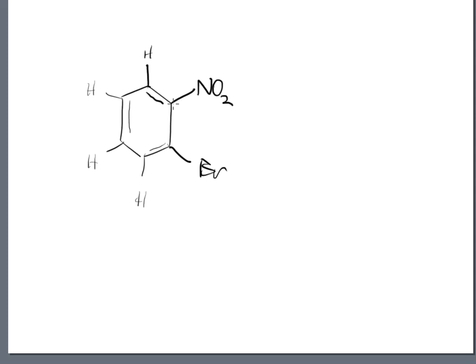All right. So this carbon with the NO2 group cannot generate a signal. There's no hydrogen there. And then this bromine cannot generate a signal. There's no hydrogen there either. However, this one can generate a signal, and that's because there's a proton there. That's our first carbon so far. Ding dong! So there is a carbon with some protons, and those protons can generate a signal for us.